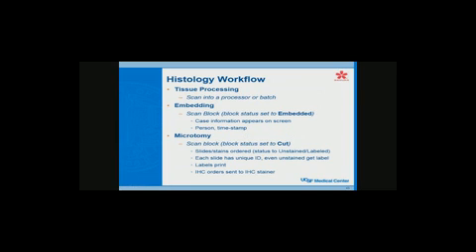So this is kind of what they go through in grossing. They have to scan the requisition and containers to start. If they scan the wrong ones, then they get a warning saying that doesn't match. It goes on to show that when they scan the cassette at grossing, it shows that it's turned to gross here, so they know it's finished. And then in histology, it goes into tissue processing. We scan the processor, the cassette to produce a batch, so we positively know that that cassette is in that batch because we scanned it.